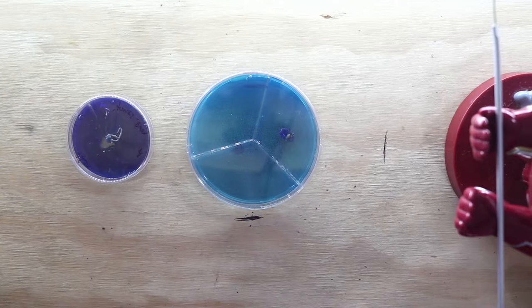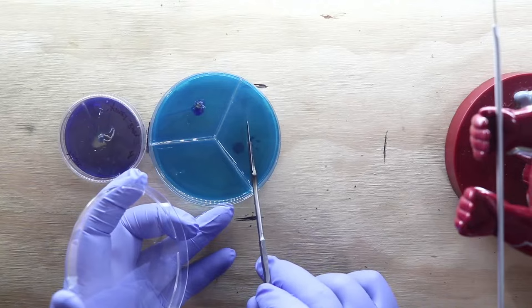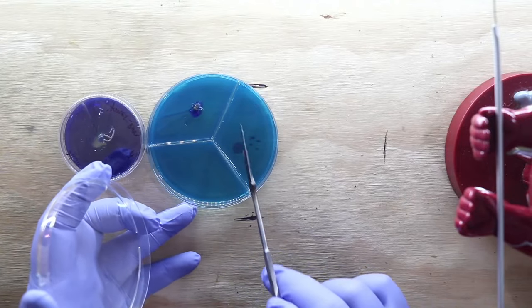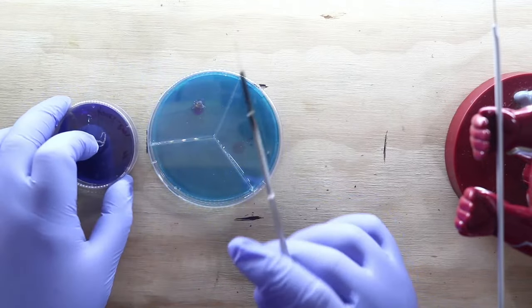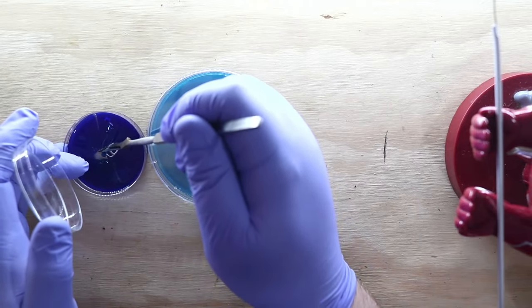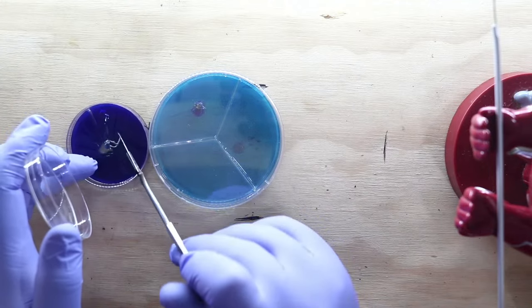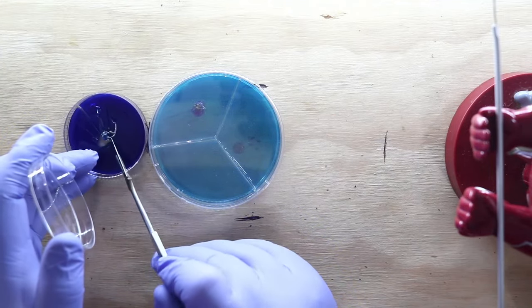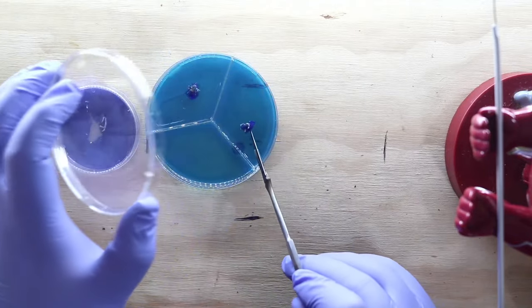Clean the blade. Rotate over. Chris said they're very spider-looking. Yeah, they're crazy-looking. They look like something from Stranger Things, is what I hear a lot of the time. I agree with that. I'm going to cut those again. And I'm going to cut these short right here, and place them right here.